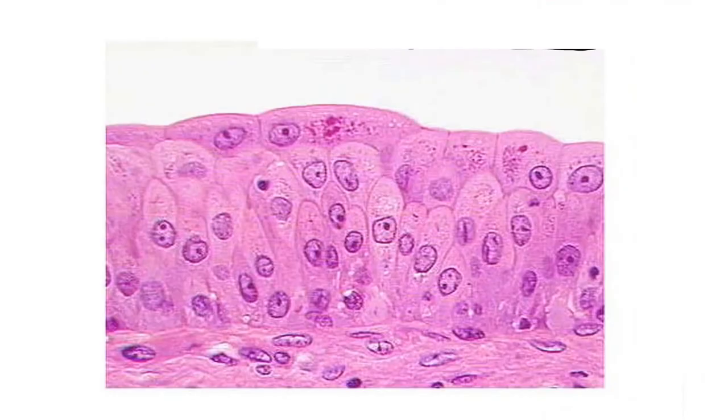All right, what do you see here? Well, I see our scream guy. There he is. I see these teardrop-shaped cells. I don't see any binucleate cells at the top, but already this is screaming to me this is transitional epithelium. And it is. The function is to transition, right? To get squashed and then come back up as the urinary bladder fills with urine. So location on here would be the urinary bladder, ureters, and some of the kidney tubules.